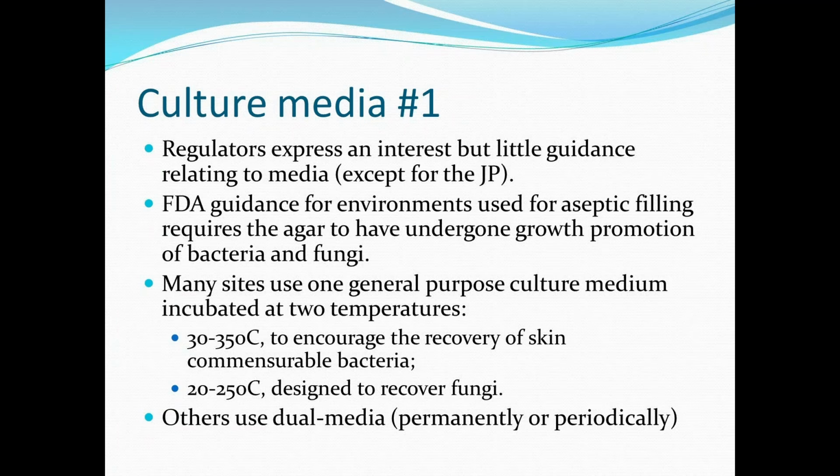So, with most things environmental monitoring related, there's a variety of practice. Some sites use a general purpose culture media incubated at two temperatures. This would probably be a higher temperature, so 30 to 35 degrees, to encourage the recovery of skin commensal bacteria, and a lower one at 20 to 25, perhaps designed to recover fungi and some other bacteria.